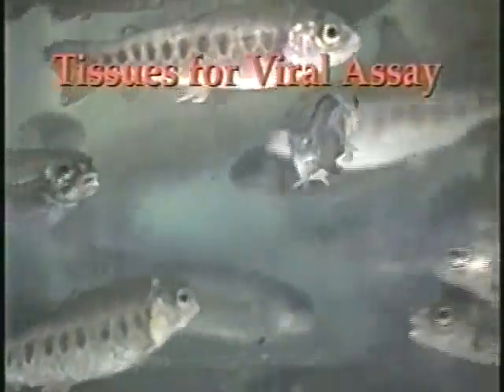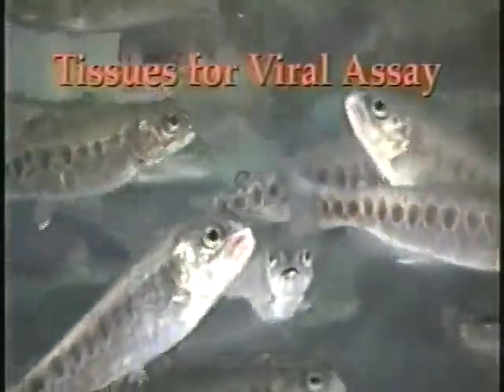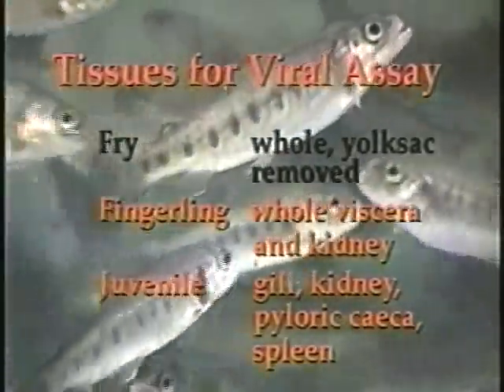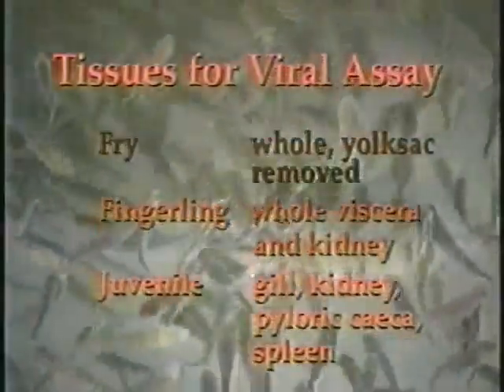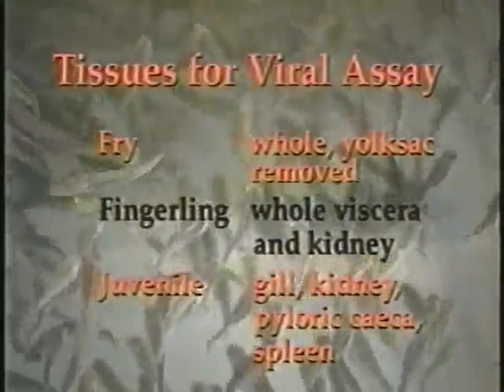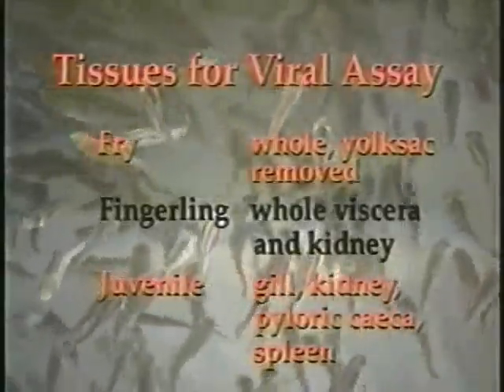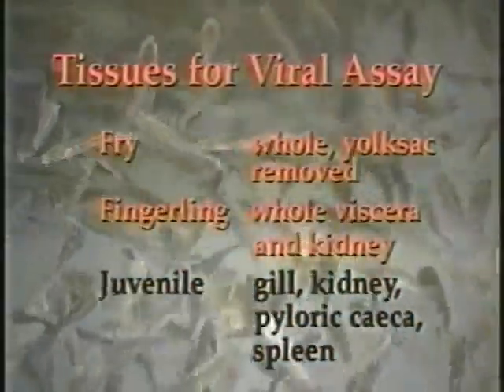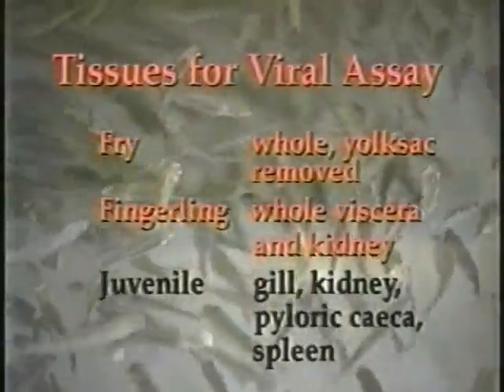However, the choice of tissue varies with the age and life stage of the fish. For fry, the entire fish is sampled, removing the yolk sac if it is still present. For fish between 4 and 6 centimeters, the entire viscera, including the kidney, is removed. For larger juvenile fish, portions of the gill, kidney, pyloric ceca, and spleen may be collected.